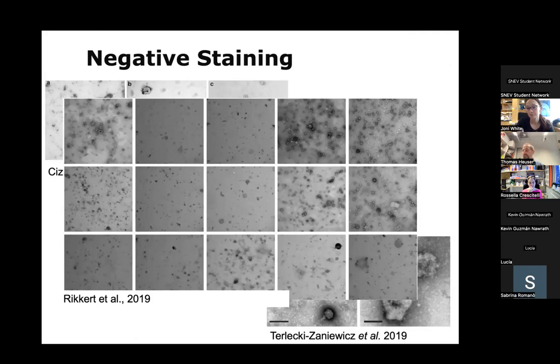I think you can, depending on how long you allow it to incubate. Yeah, I usually leave them 5 minutes. You do less. For some samples we do this shorter, but typically longer incubation times should get you more of your vesicles on your grid.